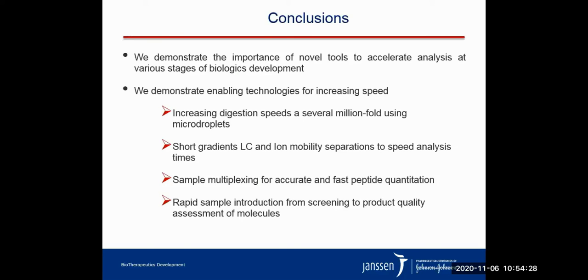Next, we examined short gradient LCs and ion mobility separations to speed up analysis times at unprecedented speeds. Sample multiplexing for accurate and fast quantitation was also demonstrated using tandem mass tag approaches. And finally, rapid sample introduction from screening to product quality assessment of molecules was demonstrated.